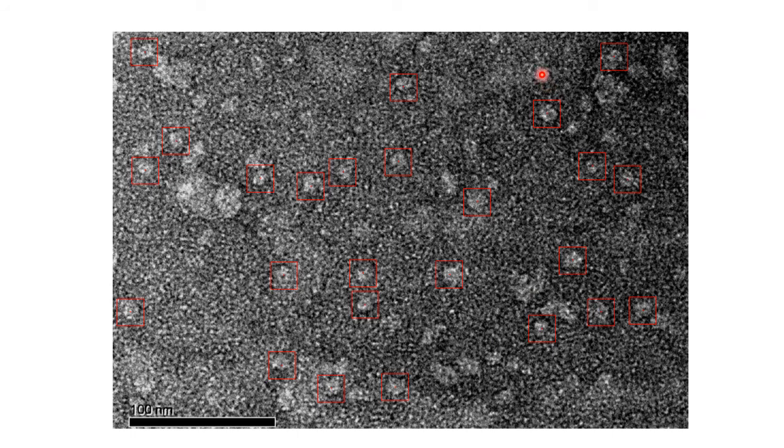All these different images which are visible here are representing different orientations of the same specimen. Multiple images of the specimen are collected, and then by using powerful imaging software, the specimen molecules which are in the same plane are collected.